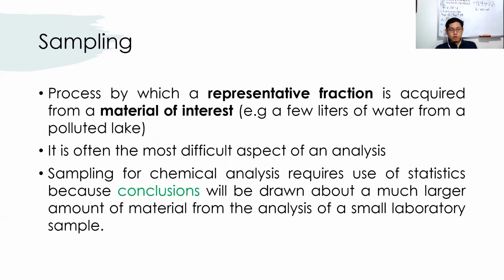yung polluted lake or yung river or yung ocean. Hindi mo pwedeng kuhanin yung whole river, whole lake, whole ocean and bring it to your laboratory. So dapat kumuha ka lang ng representative fraction.